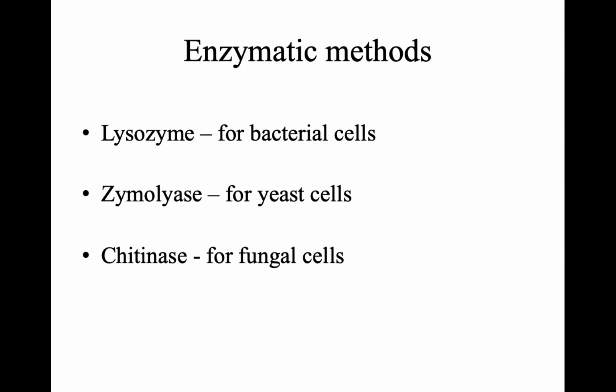We can also cleave the cell wall of yeast cells by using zymolase. This zymolase has beta-1,3-glucanase activity, and it is used for cleaving the cell wall of yeast cells. Whereas chitinase is used for the removal of the cell wall from fungal cells.